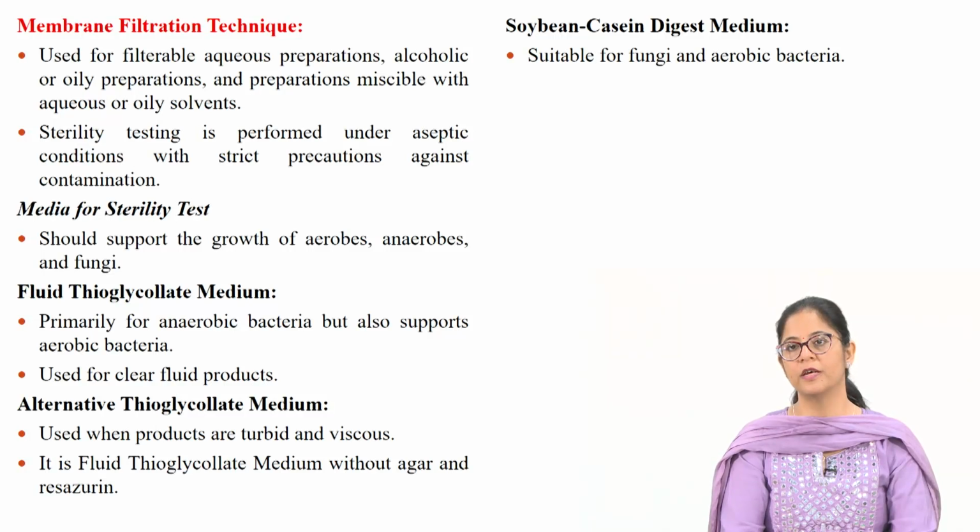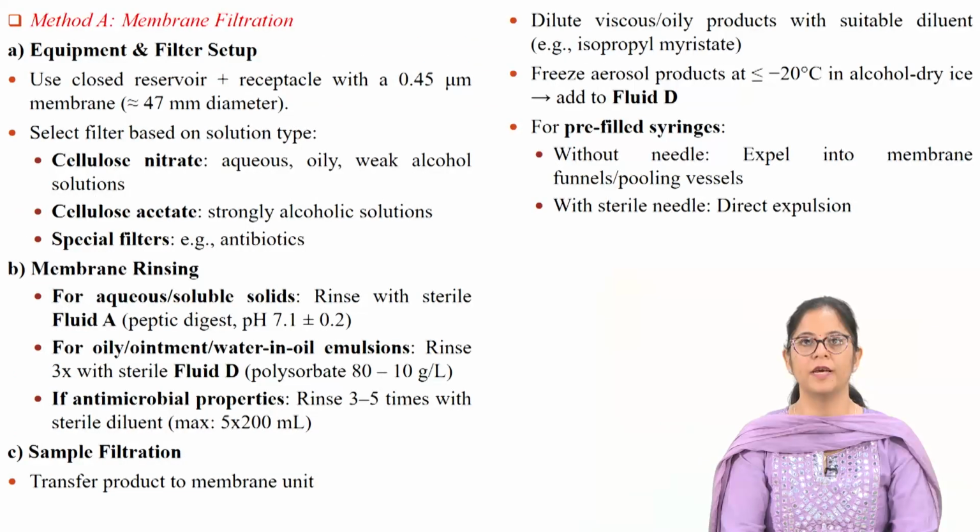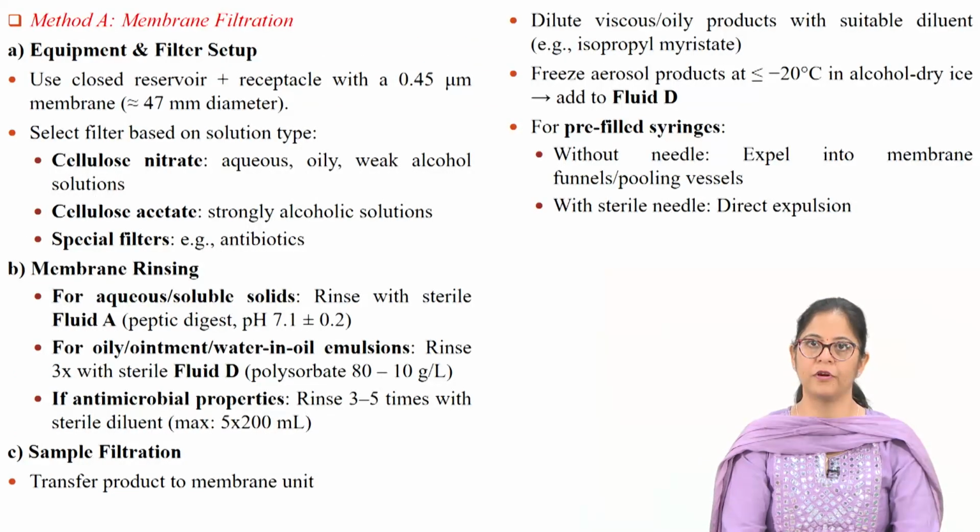In this fluid, there is absence of agar and resazurin. The soybean casein digest medium is used for fungi and aerobic bacteria. So, the next is the process for the membrane filtration.